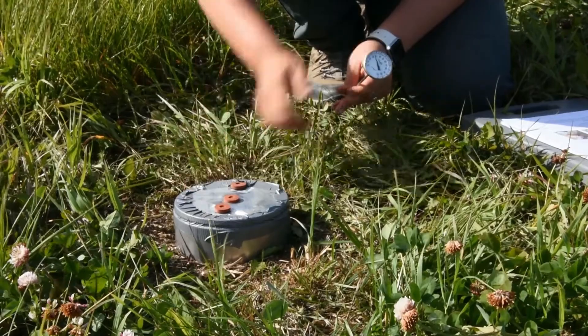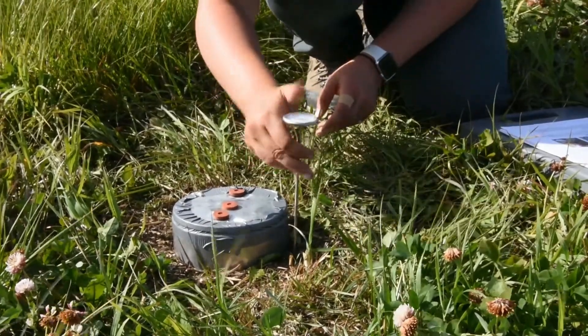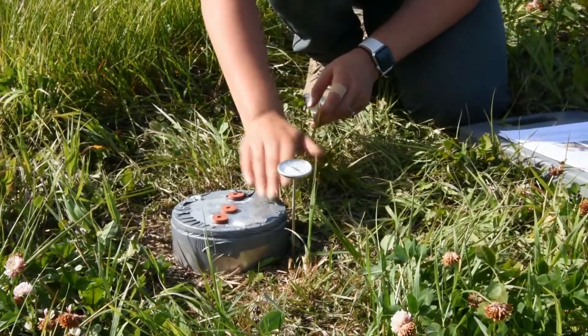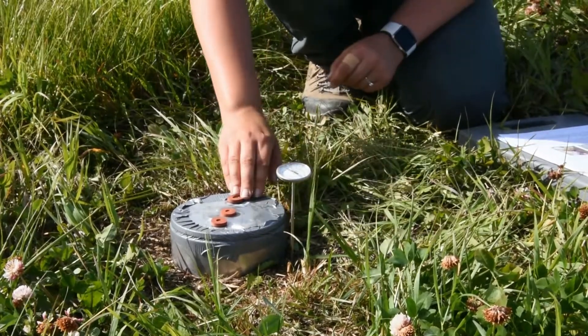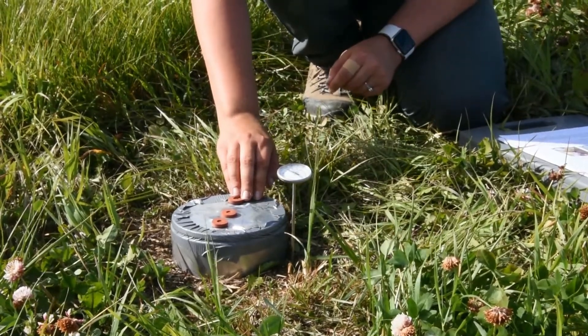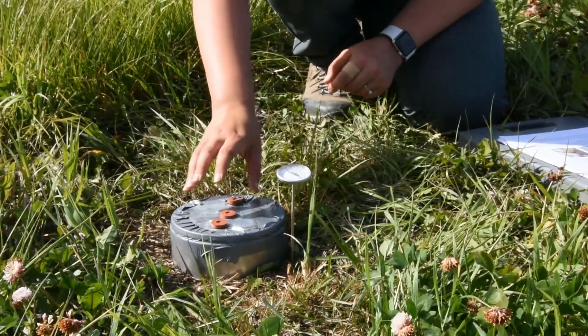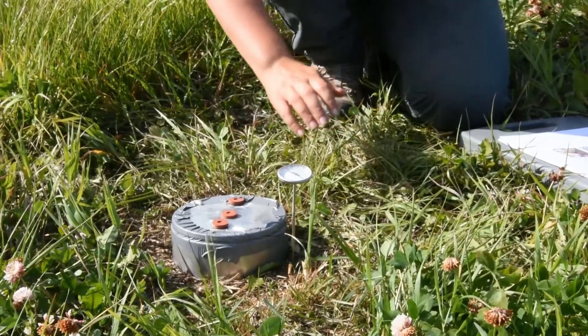The first thing we're going to do is take your soil thermometer and put it one inch into the soil somewhere near your ring, and take the soil temperature and write it down in your book. Soil microbe activity depends on the temperature around them, so different soil temperatures may impact how active the soil microbes are.